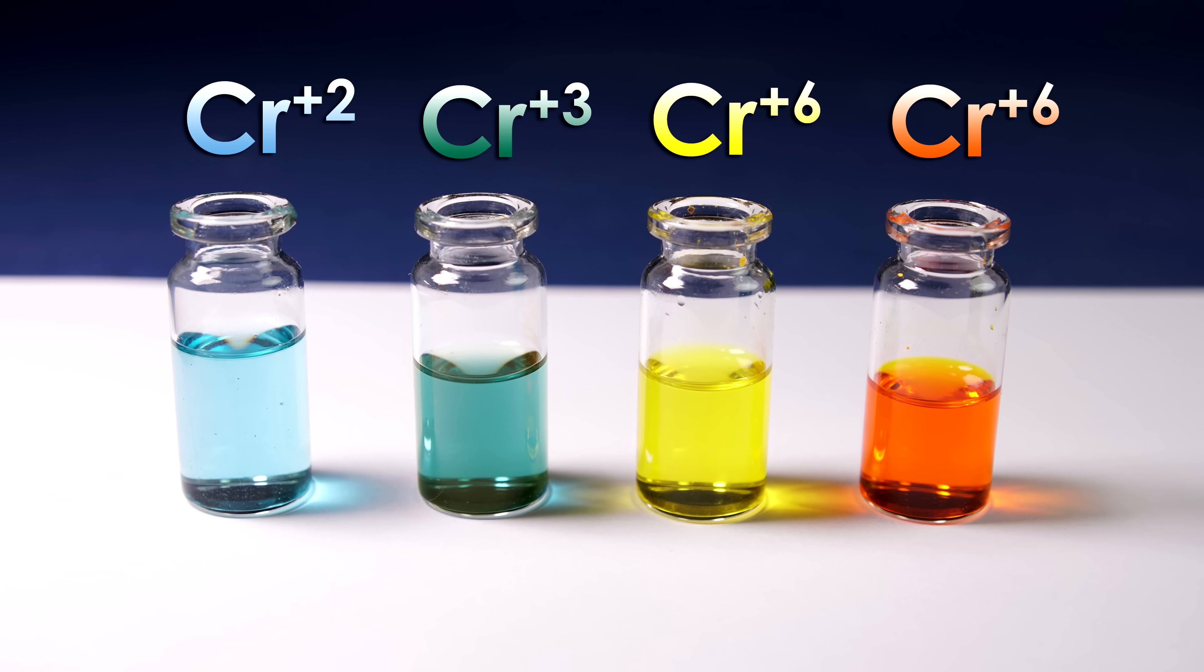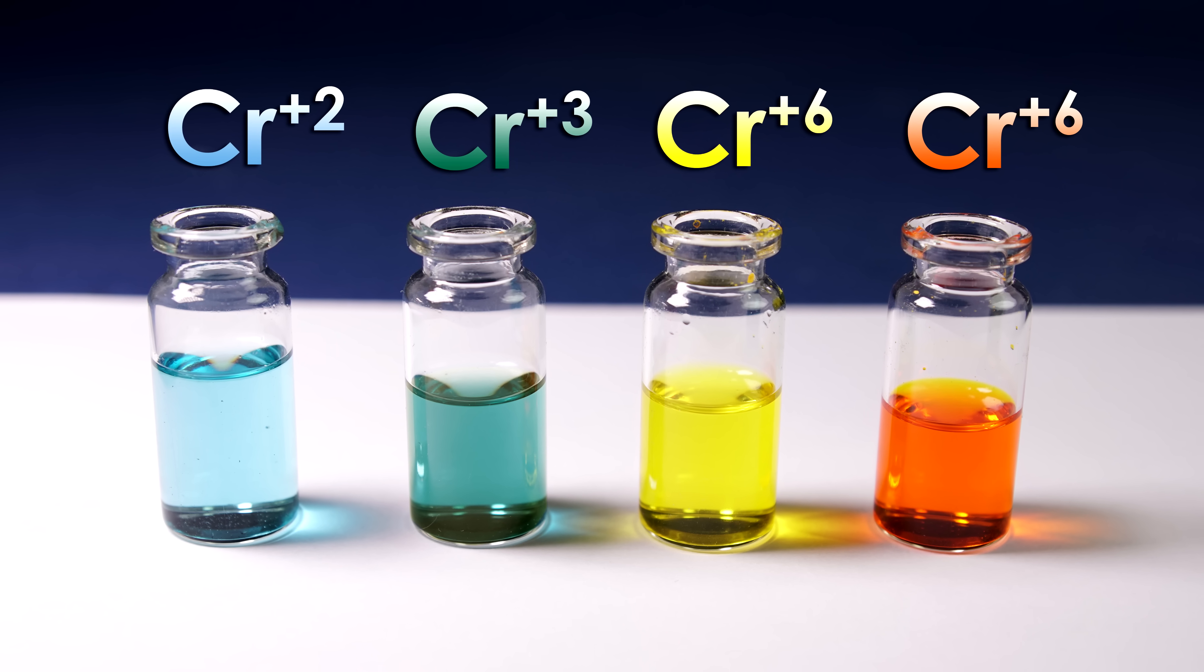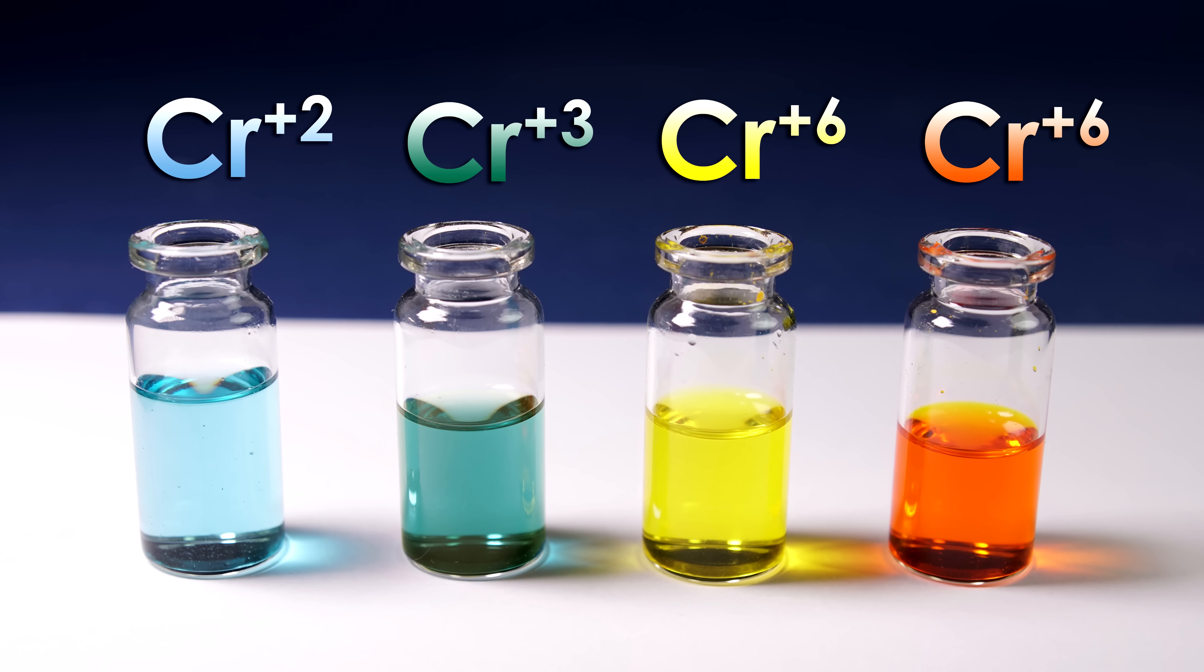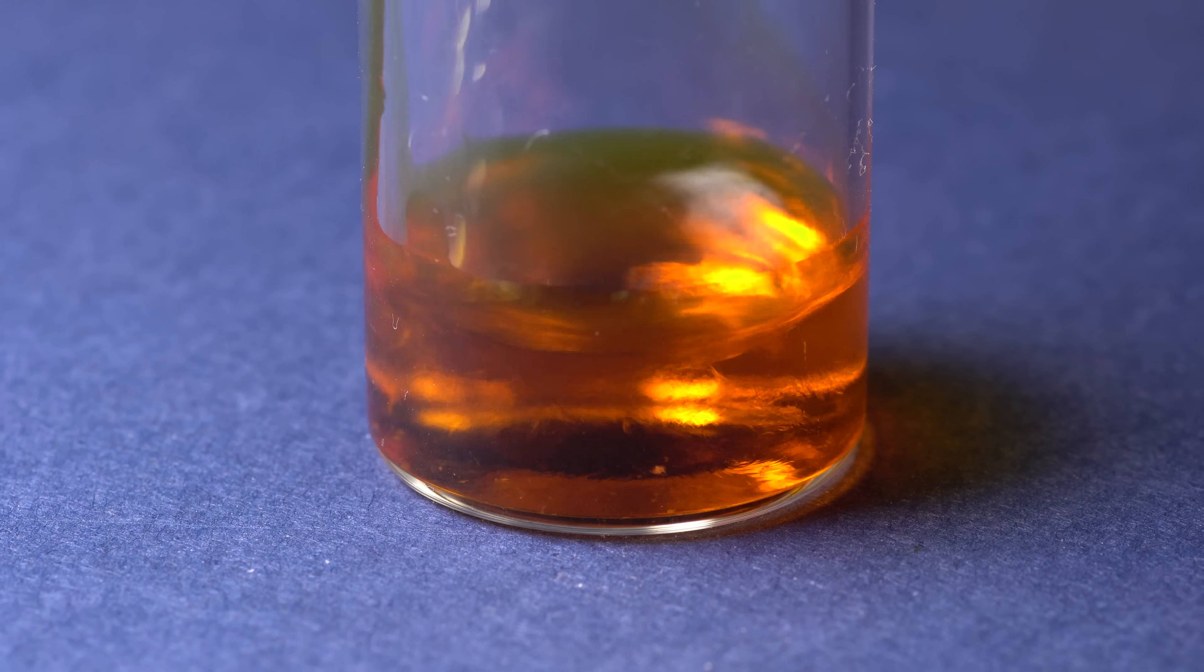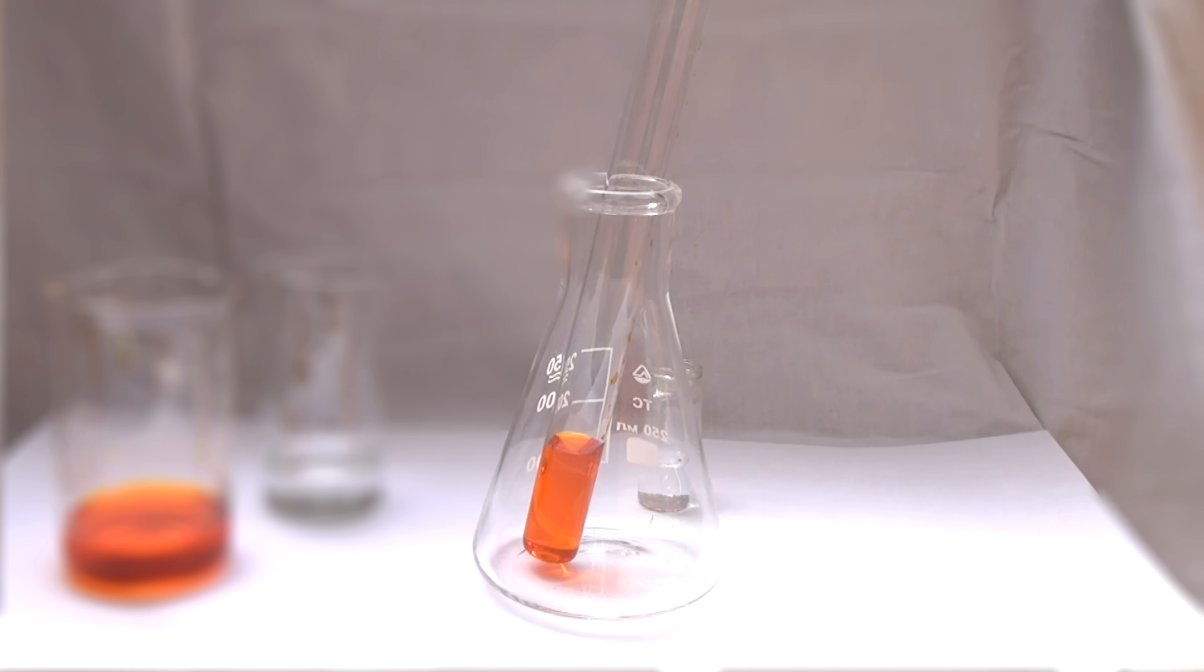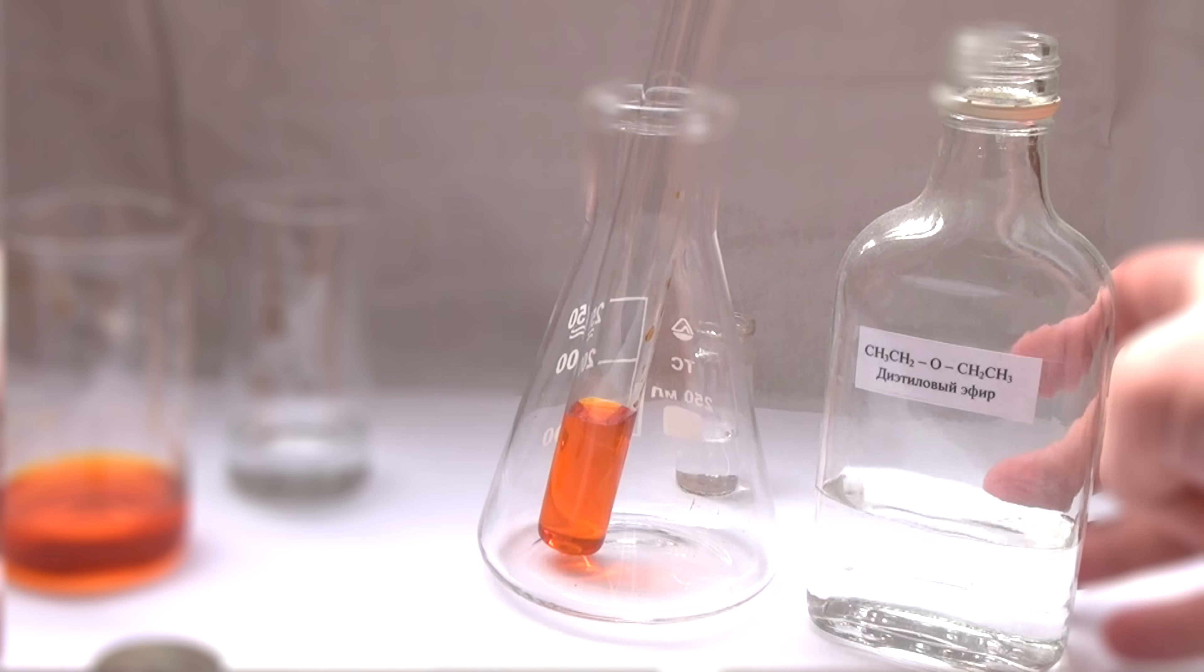So, now we have a whole set of colored chromium compounds of different oxidation states. True, that's not all. Chromium compounds can also be used for another colorful experiment, to create a flag in a test tube.